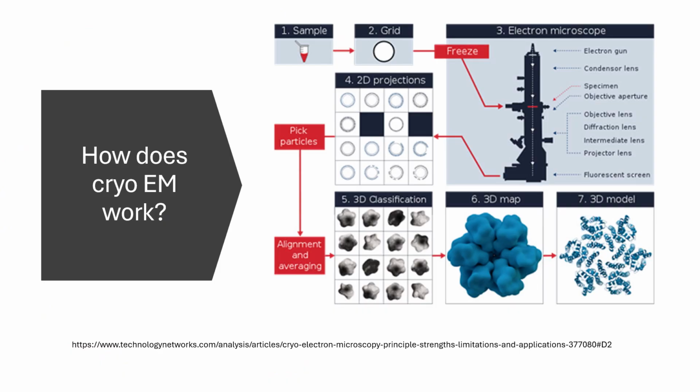The cryo-electron microscope workflow begins with the preparation of the sample, typically a purified protein or complex in solution. The sample solution is placed onto a specialized grid and then it is rapidly frozen by plunging into a cryogenic fluid such as liquid ethane. This transforms the water into amorphous ice, causing vitrification of the sample and preserving the native structure of proteins. The vitrification procedure can be performed following different methodologies, some of which are optimized to capture short-lived molecular states.